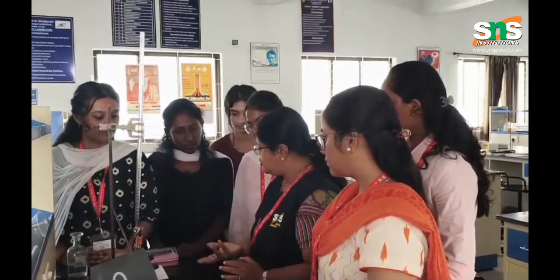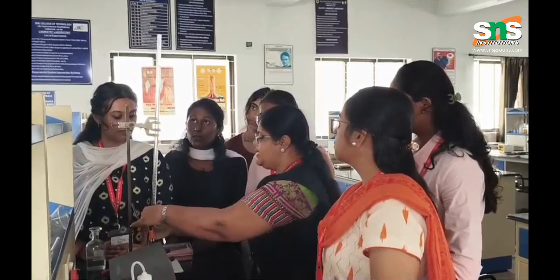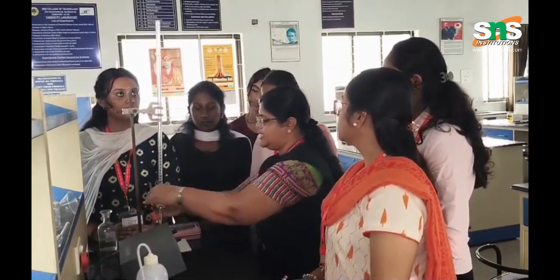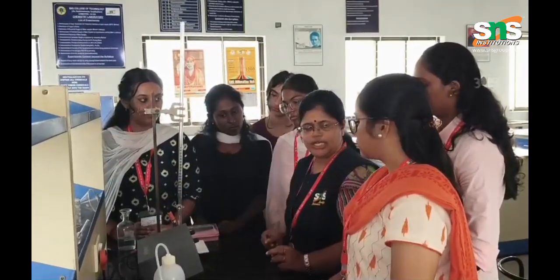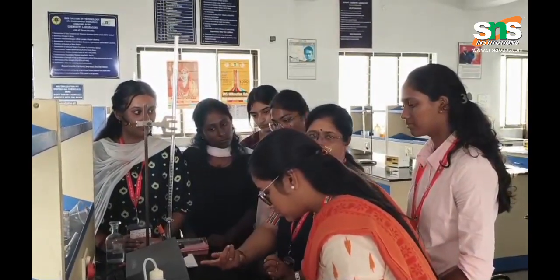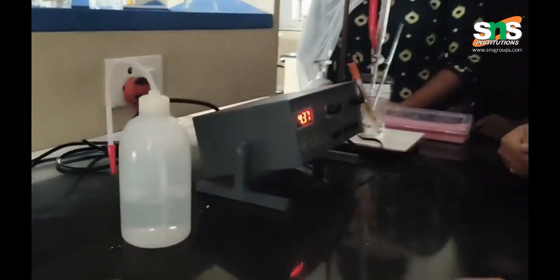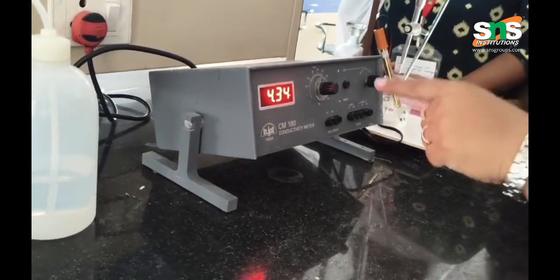You should repeat this: I add 1 ml of the base, stir the solution, and wait for the reading to be noted. Now you have noted this value.